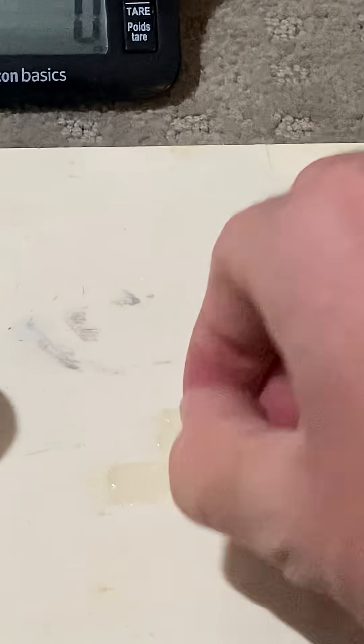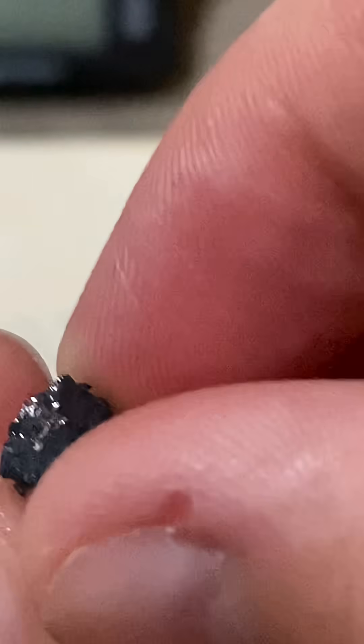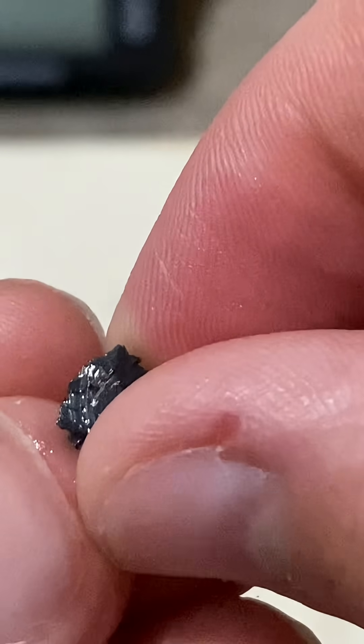I got some more pieces off. And you see that really shiny metal — it's not going to stay that way. After a couple days, it will oxidize.